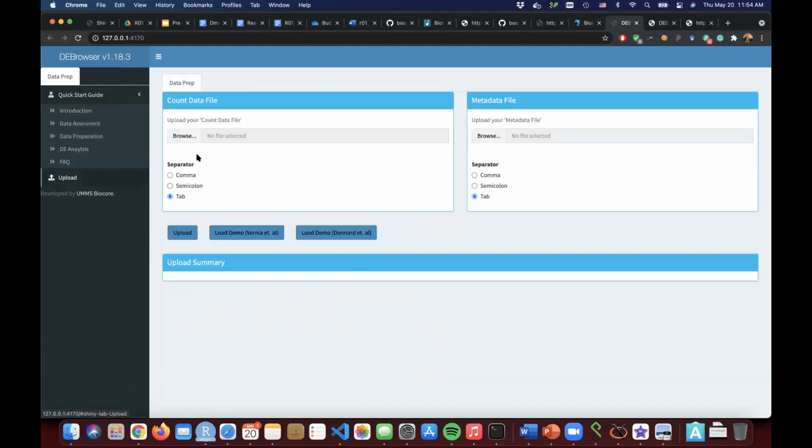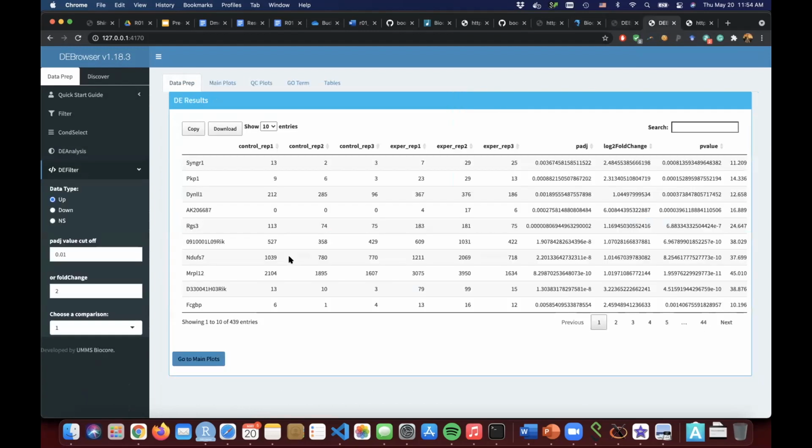When you upload the data, you already have the data. Open the Excel sheet, change the naming, and save with the new naming, and those names will appear here. Whatever the name in the file will be here. So you can change before uploading the data. You cannot change after that. I mean the orders.